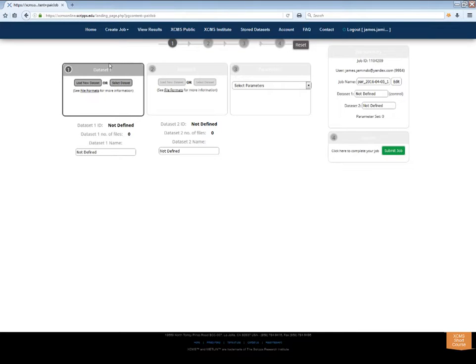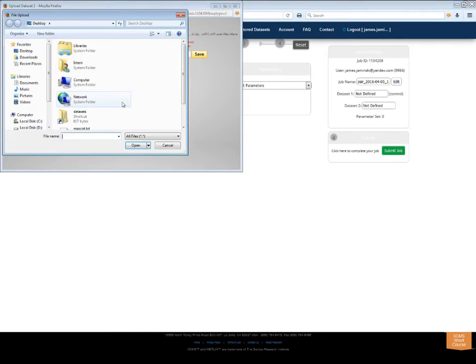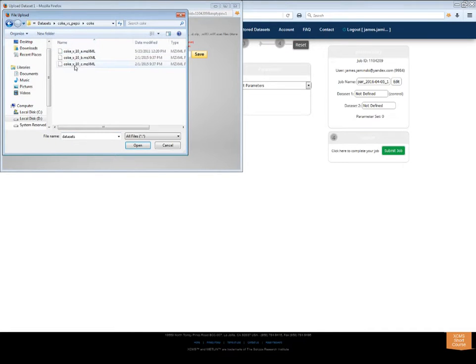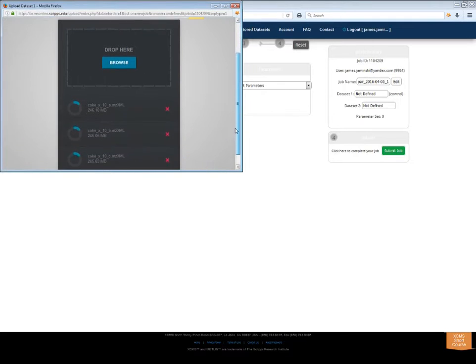The first step is to upload your control group. Click Load New Dataset in the Dataset 1 box. This will open a pop-up window. Click the Browse button to find files on your local machine or simply drag them into the window with your mouse. You will see a progress indicator next to each file as it uploads.